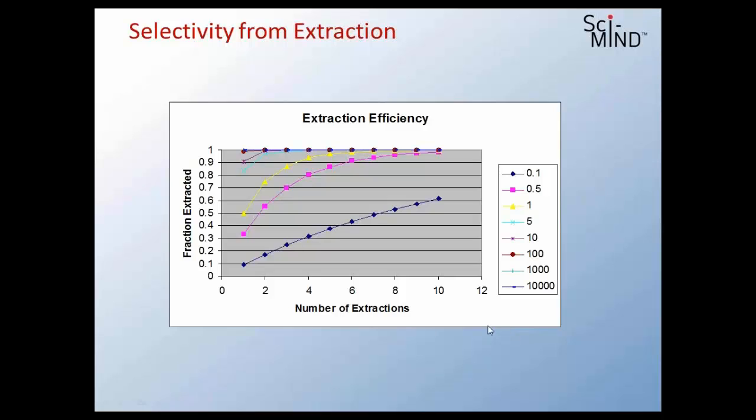I see another comment here. It says saving time is an important benefit of high resolution at low elution times, but saving solvent is important as it costs money, at least in HPLC, and I agree also with that comment as well. That's one of our challenges. That's why I commented earlier that we do have budgets and other issues involved with our method development. You bet. I'm not going to argue with that at all.